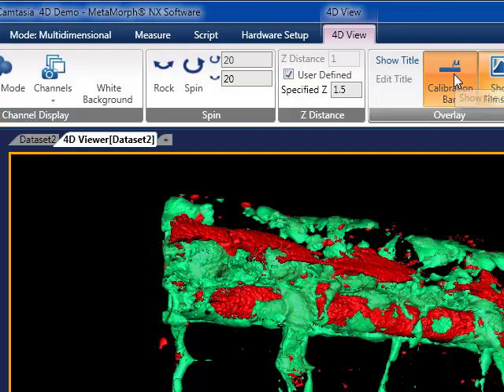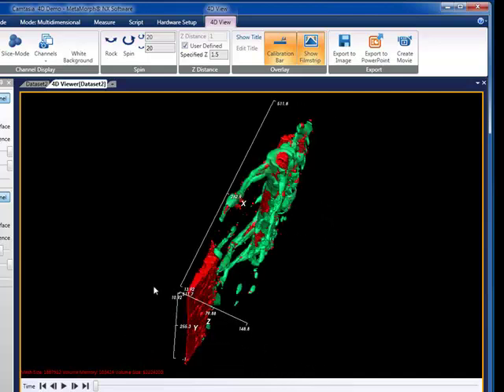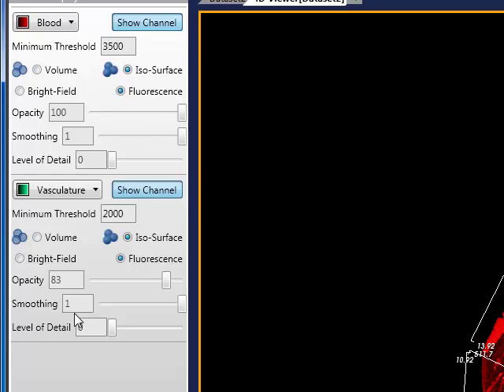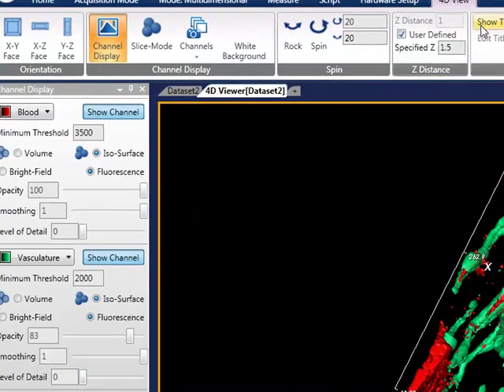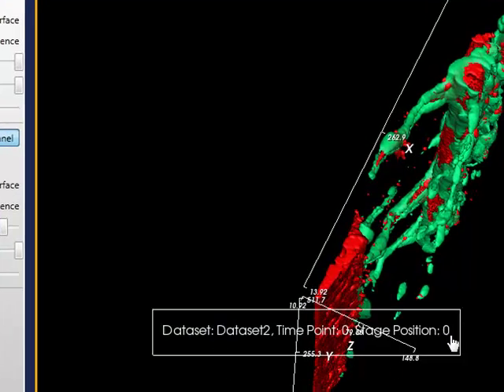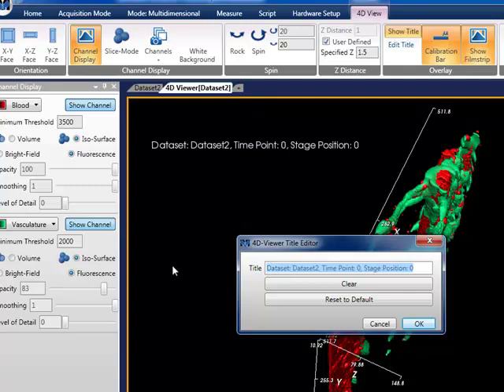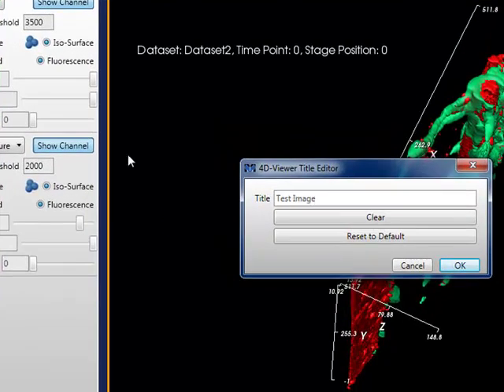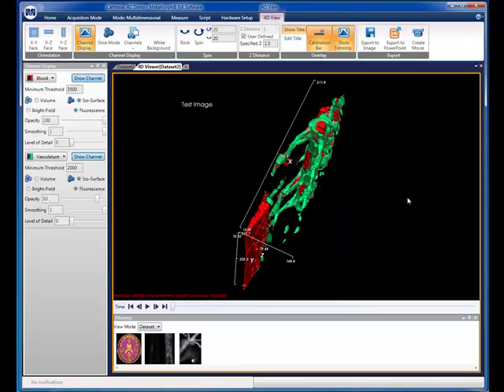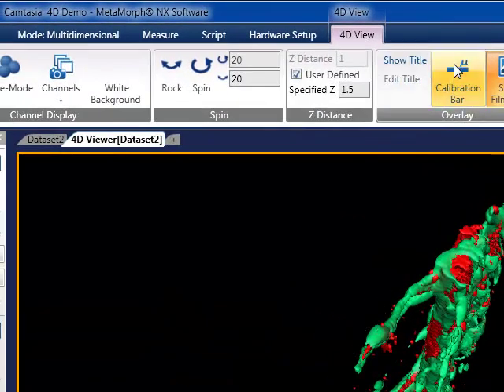Moving to the right, we can add calibration bars. We can also add some simple annotation. To help communicate your results and observations, we have three different export utilities included with the 4D viewer.